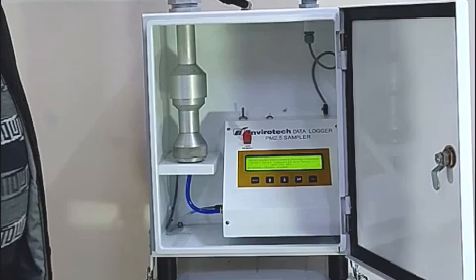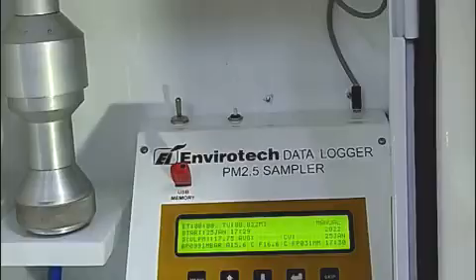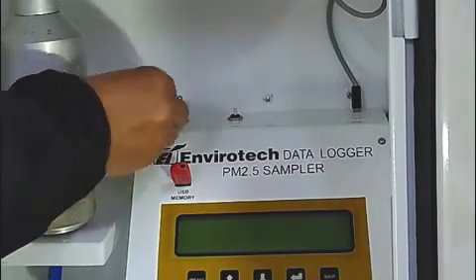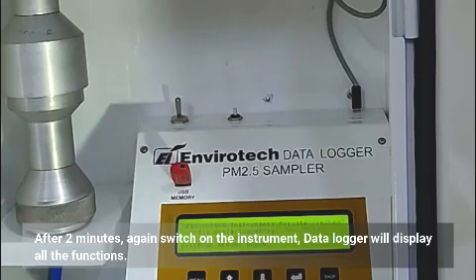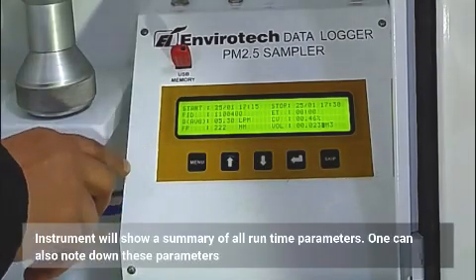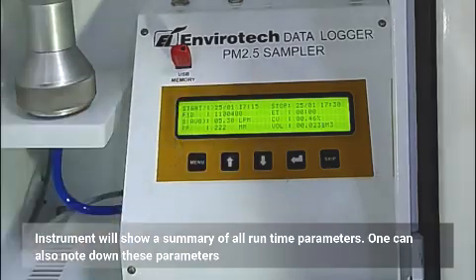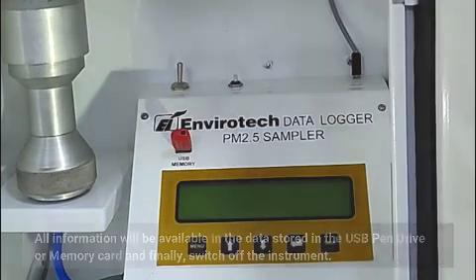After completion of sample, sampler will stop automatically at the preset time, if sample stop time was preset. In case shutdown time was not preset, then switch off the instrument. After 2 minutes, again, switch on the instrument, data logger will display all the functions. Set it to recall summary with the help of up-down keys, and then press the enter key. Instrument will show a summary of all runtime parameters. One can also note down these parameters. All information will be available in the data stored in the USB pen drive or memory card. And finally, switch off the instrument.